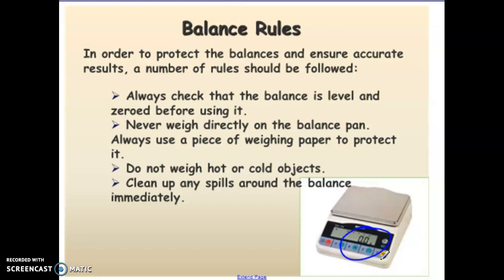It'll just say a whole number. Usually the more decimal points that a scale is able to output, the more expensive the scale is. Obviously when you are doing virtual labs, whatever the reading is, you record down. Just so you know, the ones that we have at our school record to 2 decimal places.